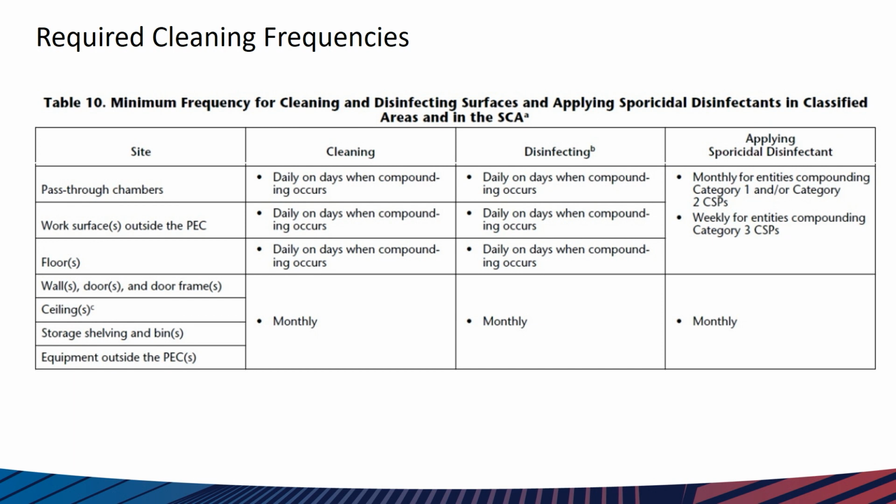So if you use the plastic Ziploc bags for your supplies in the clean room, do you keep them in there permanently in that Ziploc bag? And if so, how often do you recommend replacing the plastic bag? Or do you just put them in there while you're cleaning and then throw away that bag afterward?